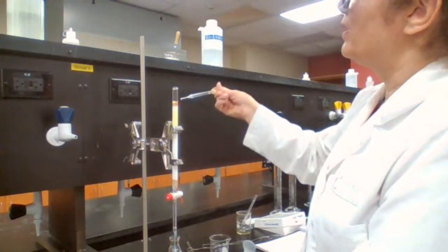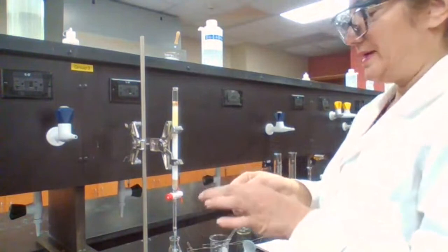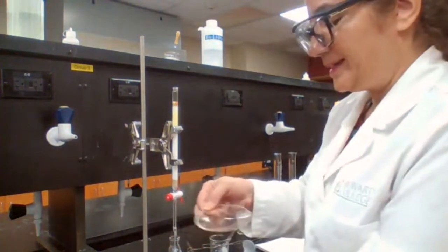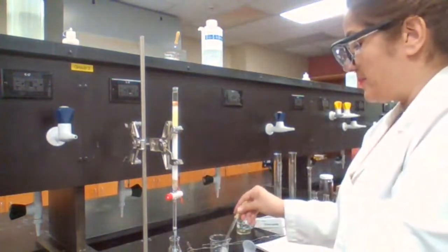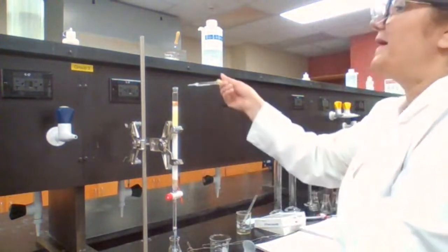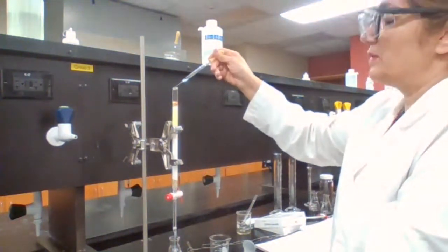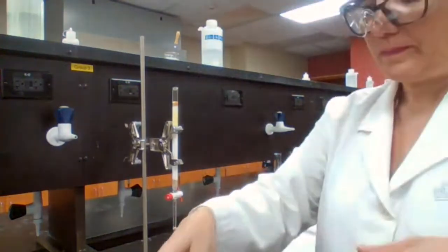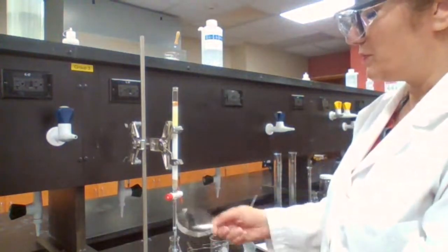The top of the column should never dry out. It should always contain some solvent, whatever solvent you're dealing with at that step. What's my next solvent? Because I have to think ahead and get my next solvent. When I switch from hexane, what should I switch it to?